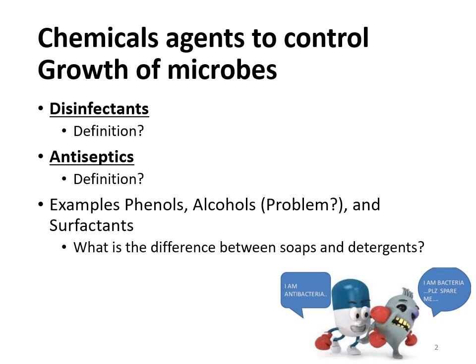We have various examples that we went over in lecture. We had phenols, alcohols, surfactants. If you remember, gaseous agents being the most strong for sterilization. Now, when we talk about those examples, there are a few things I want you to remember. One big thing is about alcohol, because so many times people think of alcohol as this fantastic antimicrobial, when in fact it has a very big weakness.